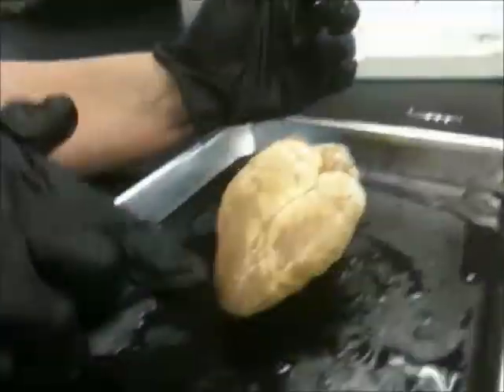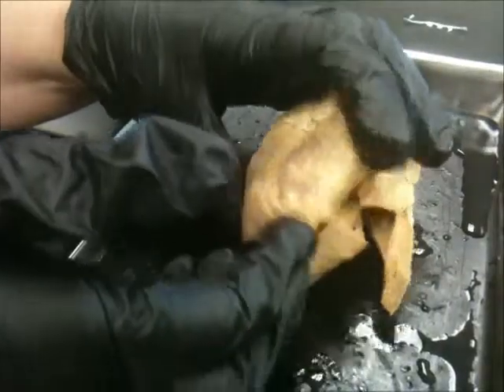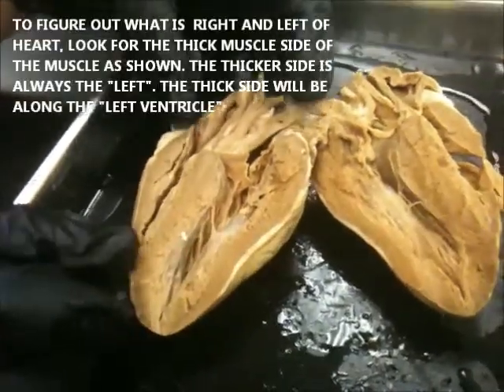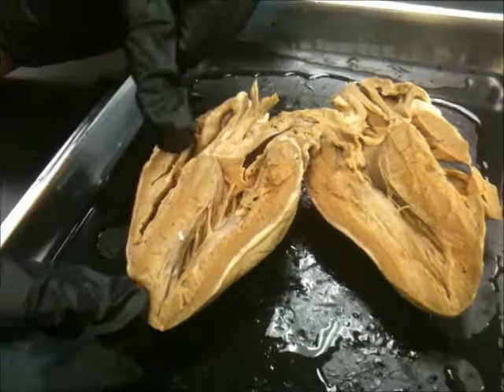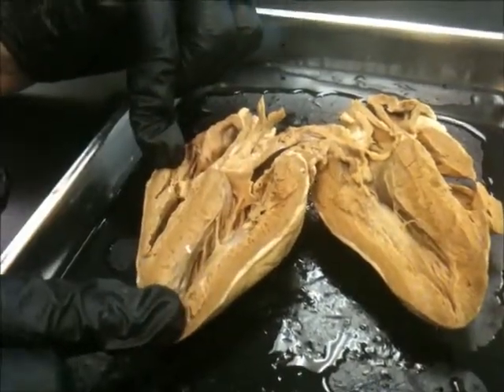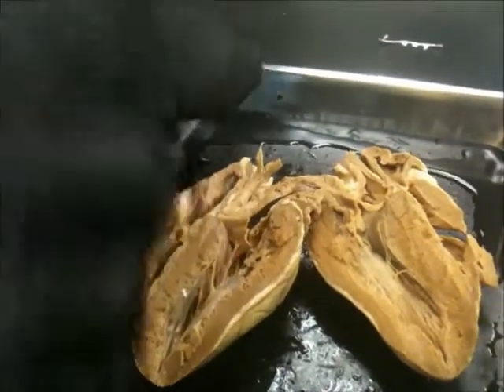You know what you look for, right? Which direction the apex is pointing is a good clue. And if you open up the heart, you're going to be looking for which side has the thicker muscle. This one has a thicker muscle, so it must be... That's the left side. That's the left side.